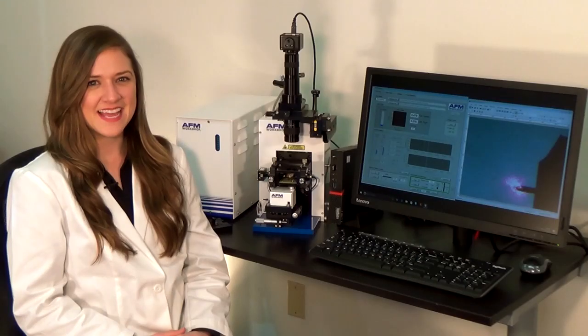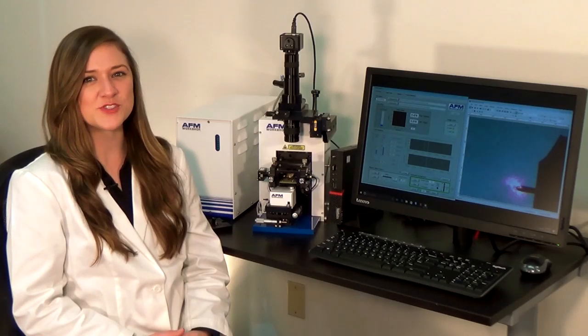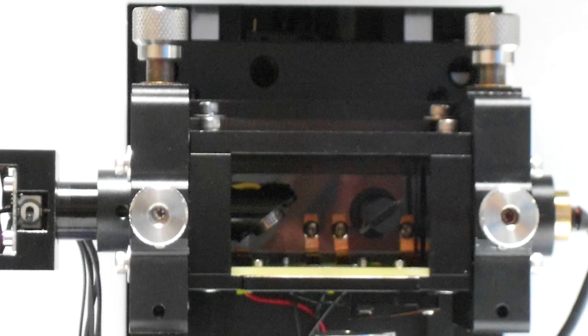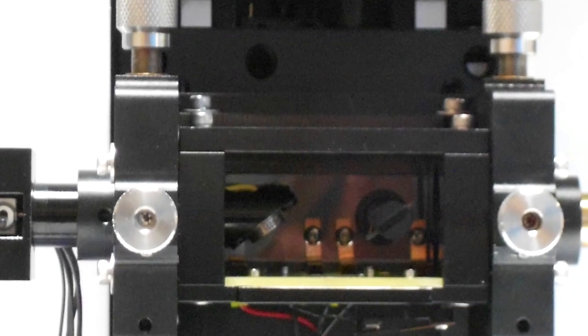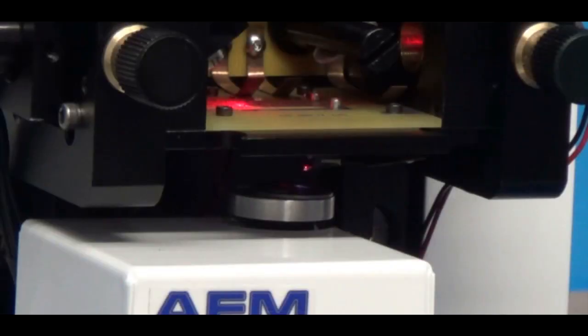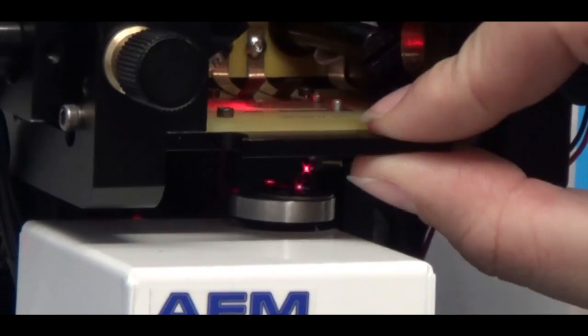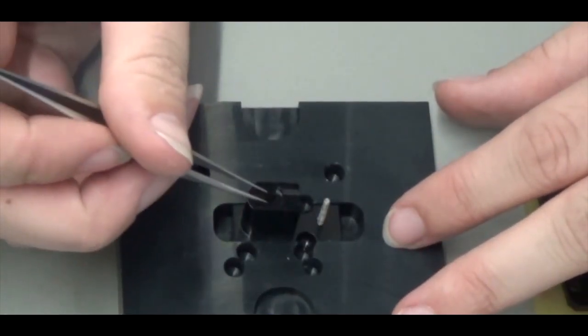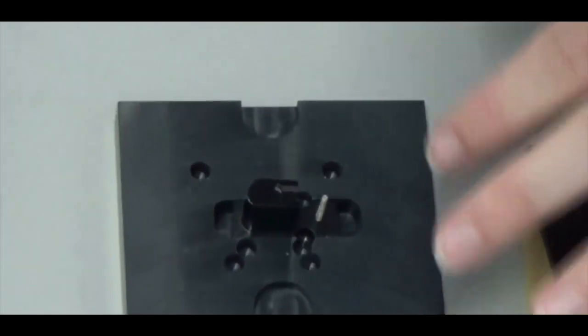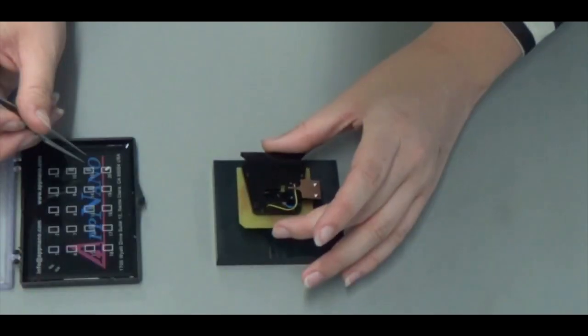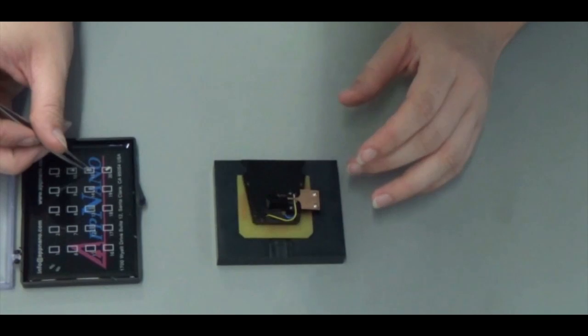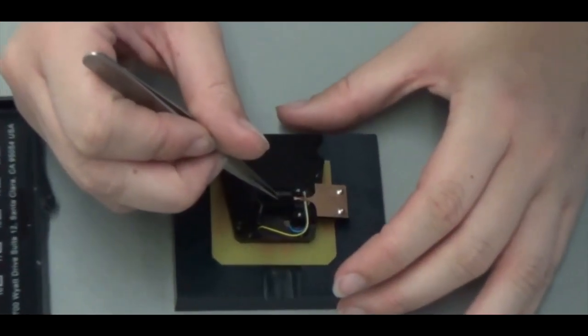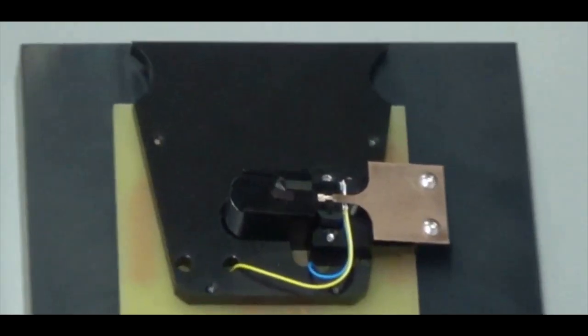The TT2 AFM industry standard light lever has an extremely unique open design with a large range photo detector and an easy to remove probe holder. By having the removable probe holder, we eliminate the risk of dropping or damaging costly parts. The probe holder comes with an exchange tool, making changing the probe easier than ever. Our probe holder also supports just about every probe on the market, ensuring you will easily be able to use the probe that best fits your application and budget.